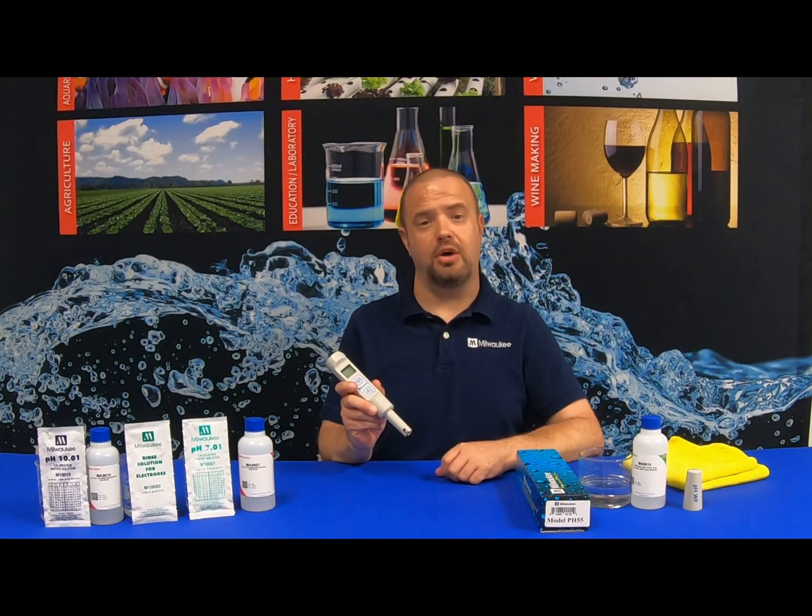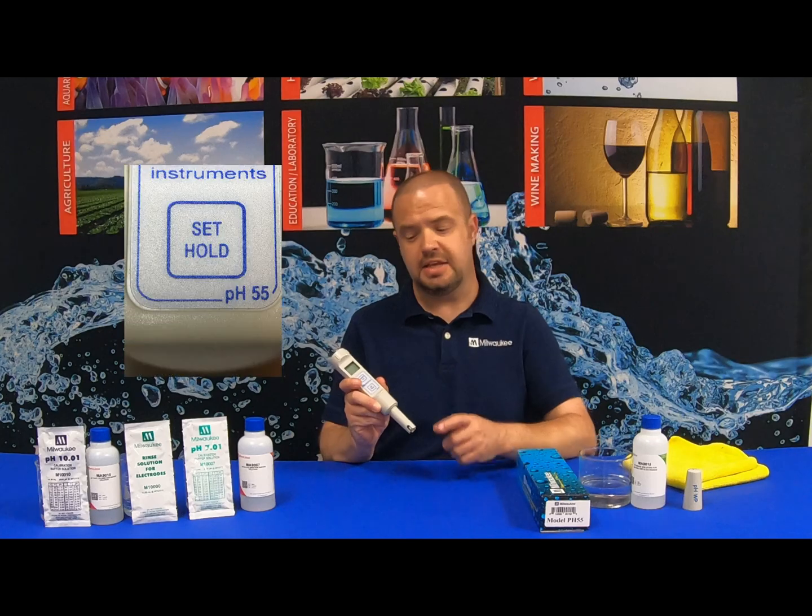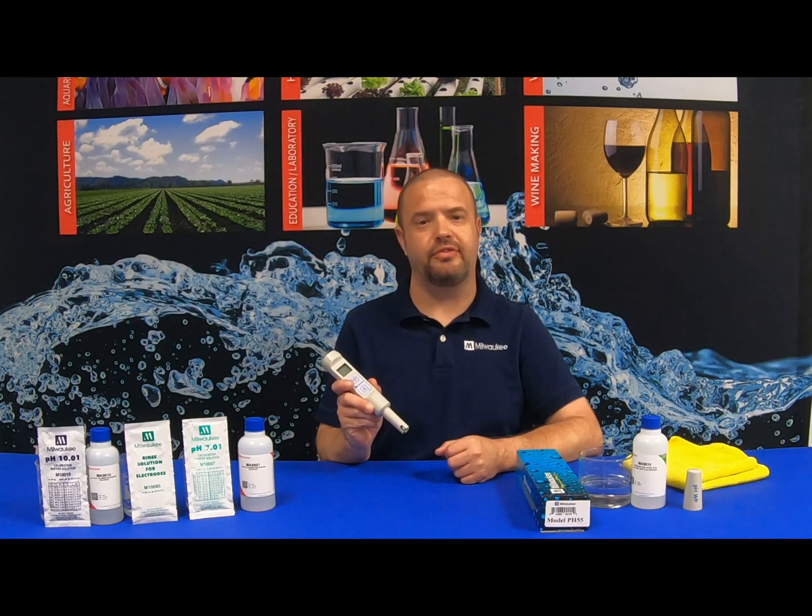Another key feature with the Milwaukee Instruments PH55 is the hold button. This allows you to freeze the display prior to removing from a sample.